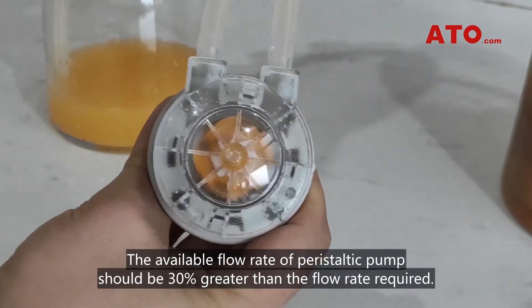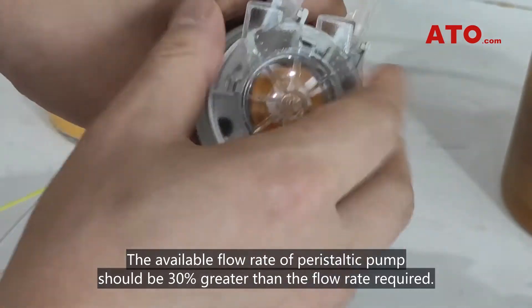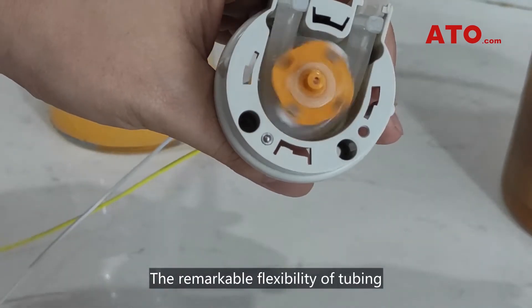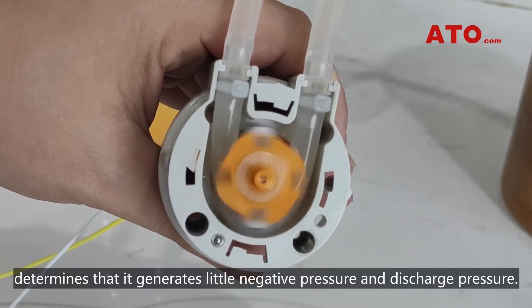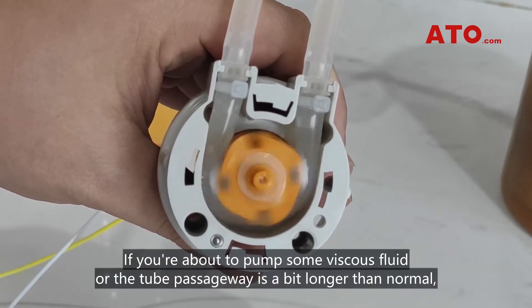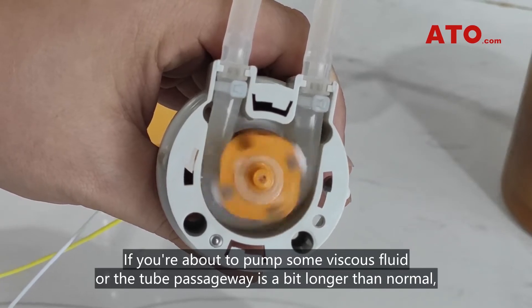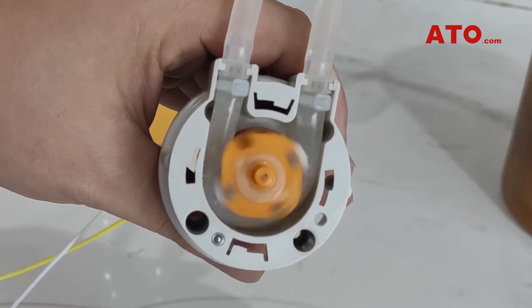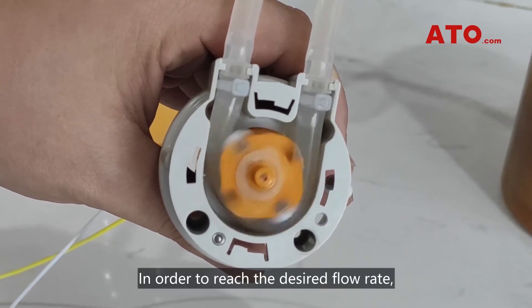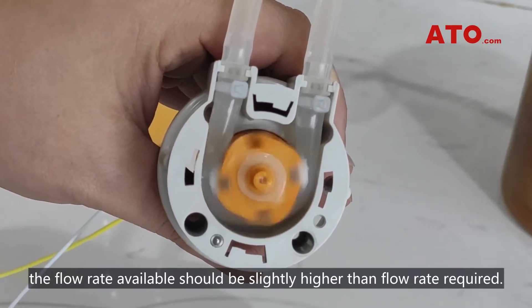The available flow rate of a peristaltic pump should be 30% greater than the flow rate required. The remarkable flexibility of tubing means it generates little negative pressure and discharge pressure. If you're about to pump some viscous fluid or the tube passageway is a bit longer than normal, you'll get lower flow rates. In order to reach the desired flow rate, the available flow rate should be slightly higher than the flow rate required.